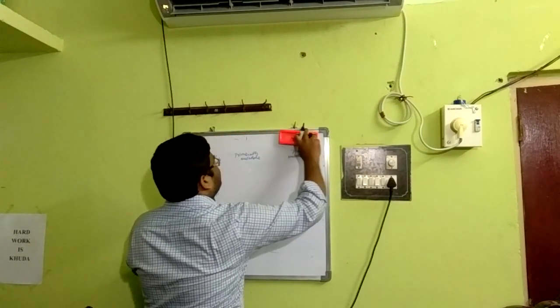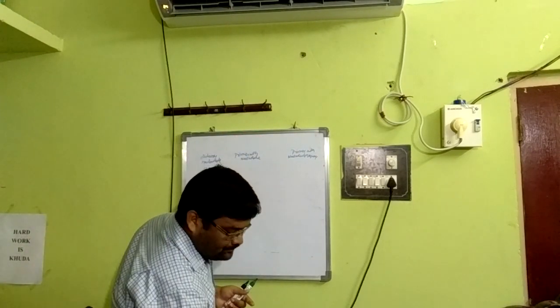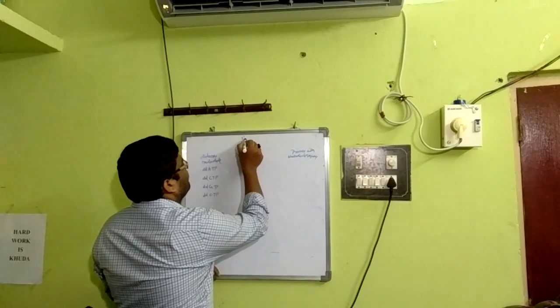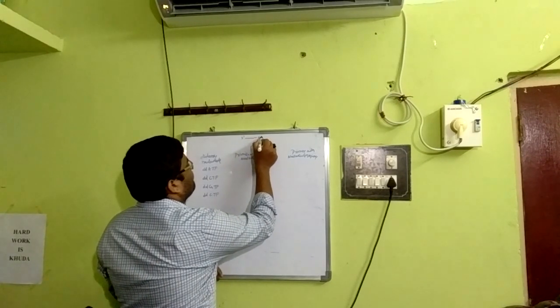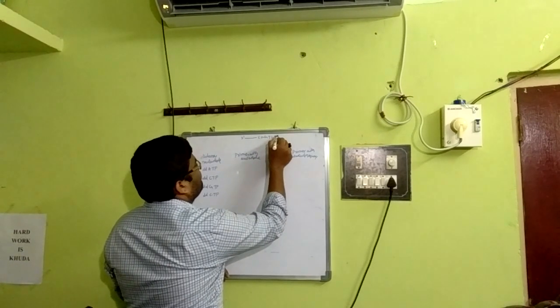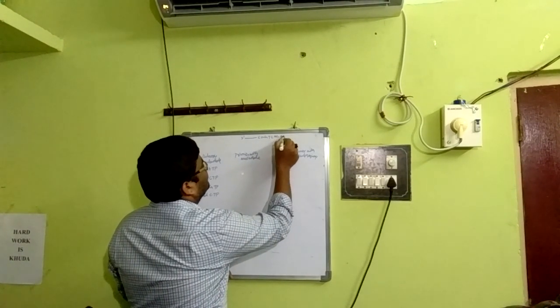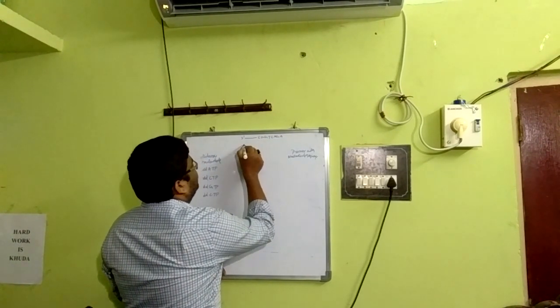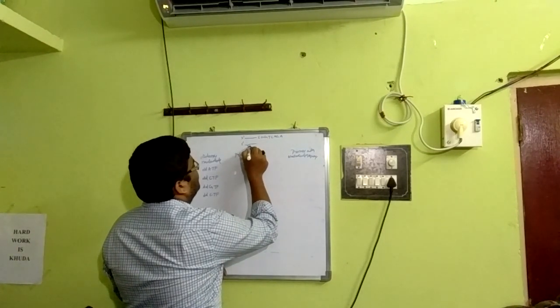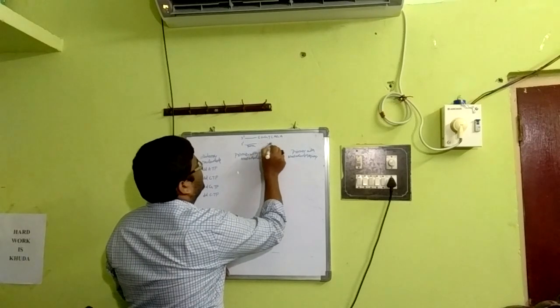Say this will be the template DNA, and this is the complementary strand. So this is the primer and this is the new DNA.